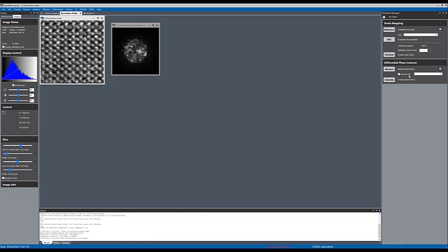If you do have a data set that has been collected in vacuum, you can measure the beam displacement in that data set and then apply that as you are calculating the beam displacements in your specimen area to make sure that you're purely measuring the properties of your material.